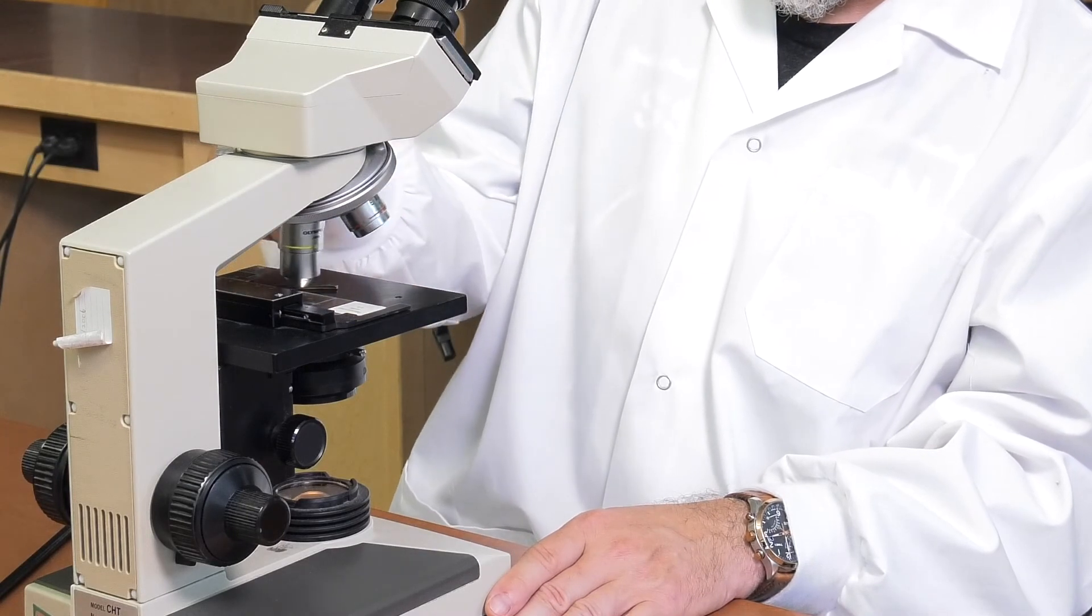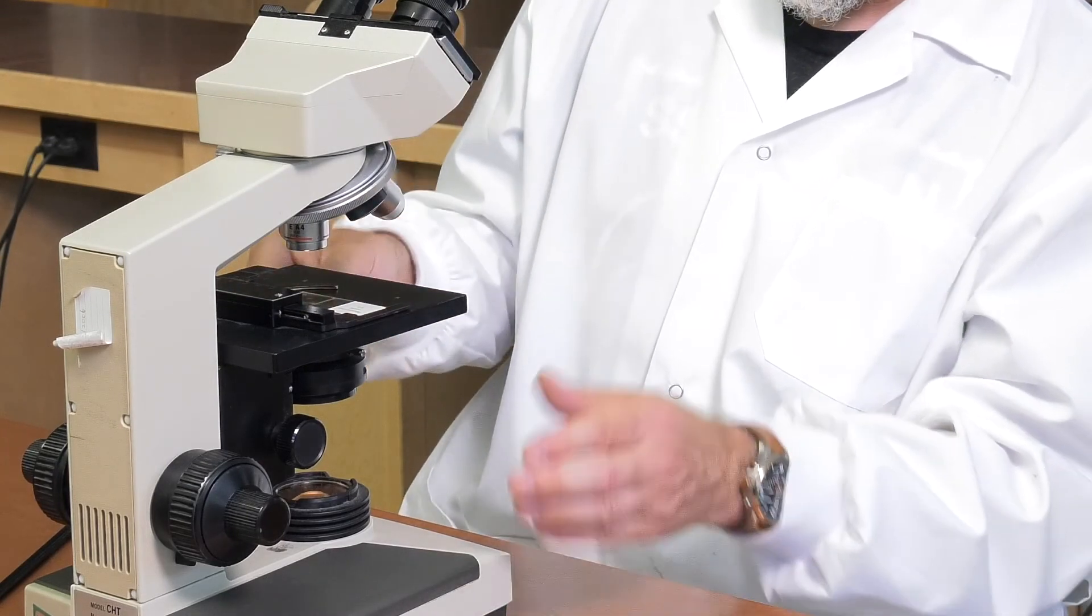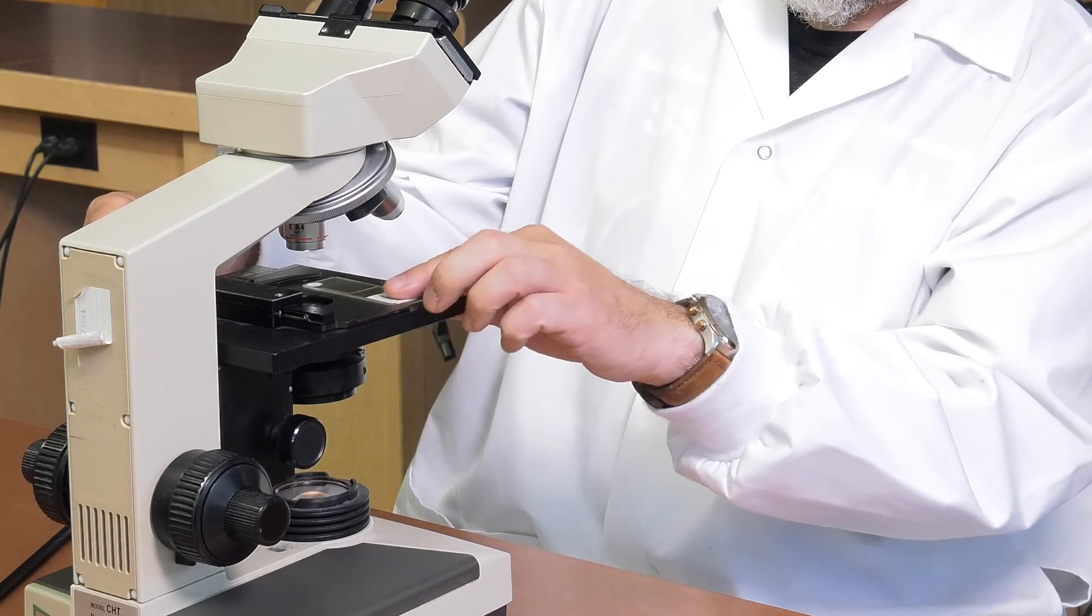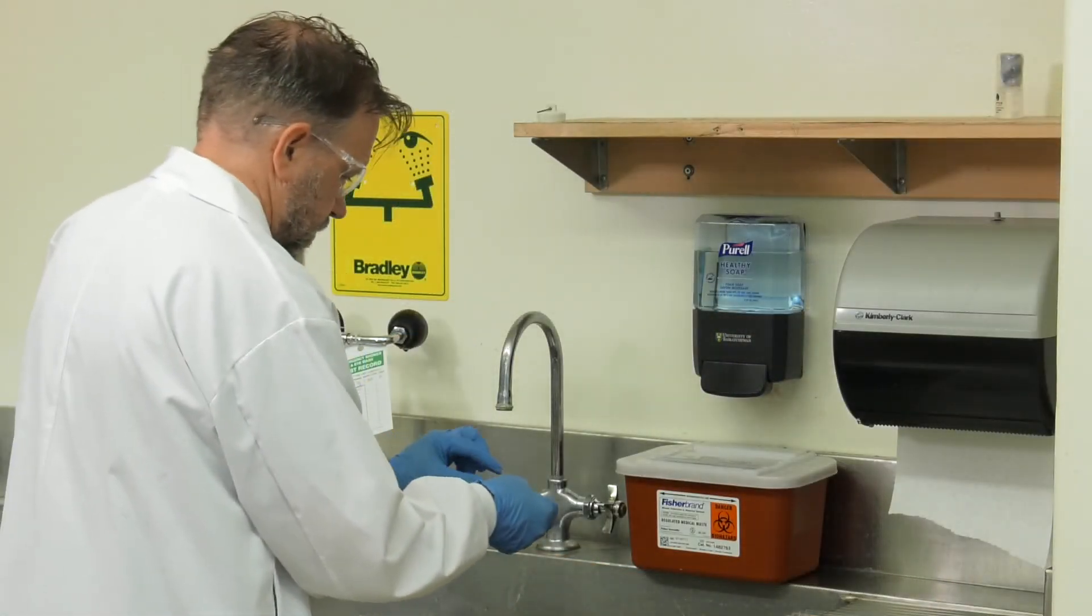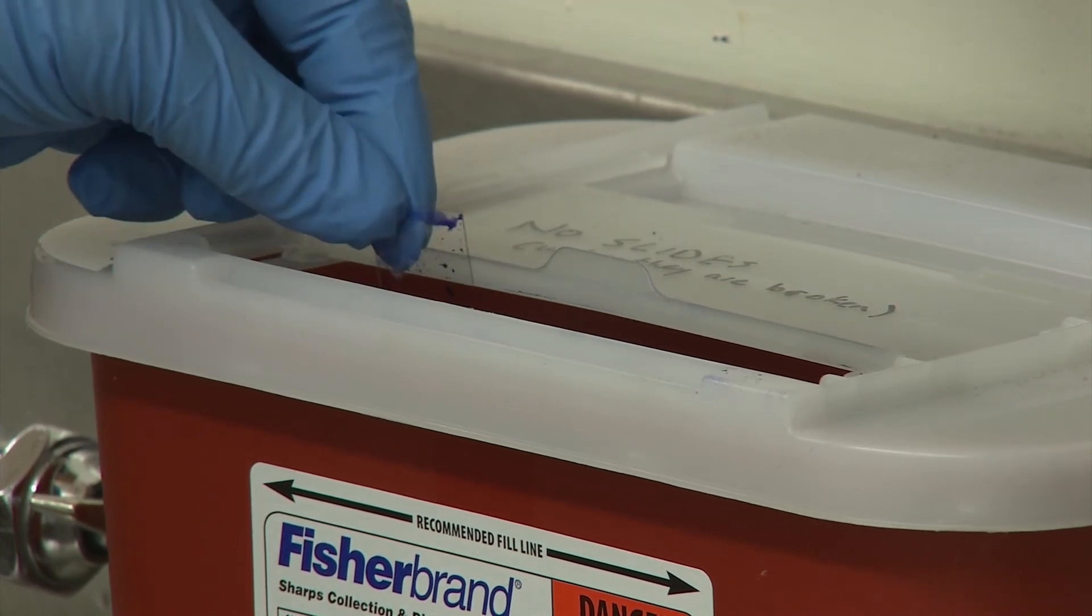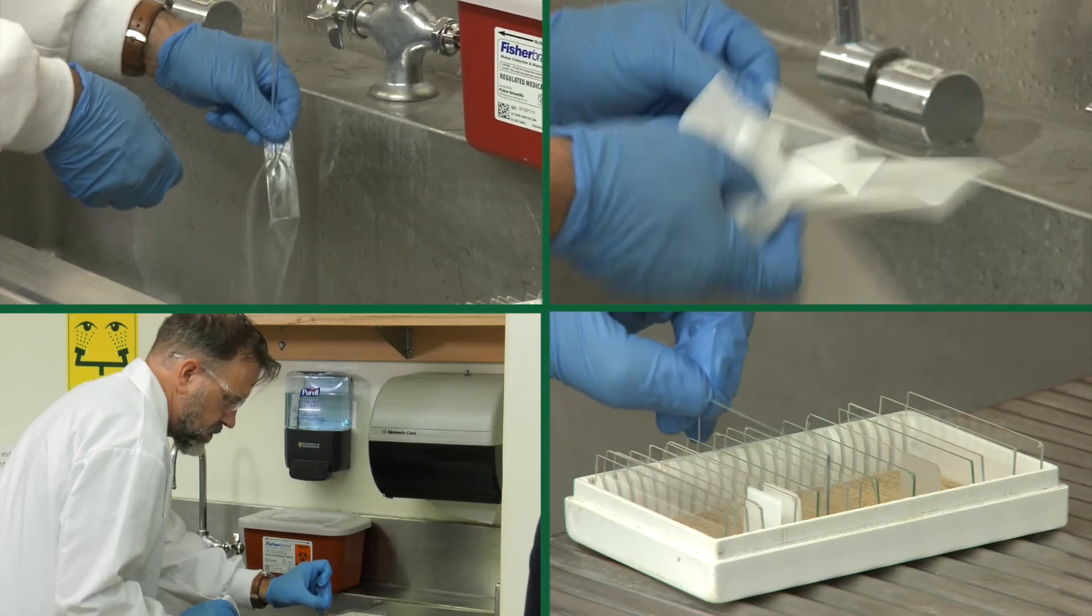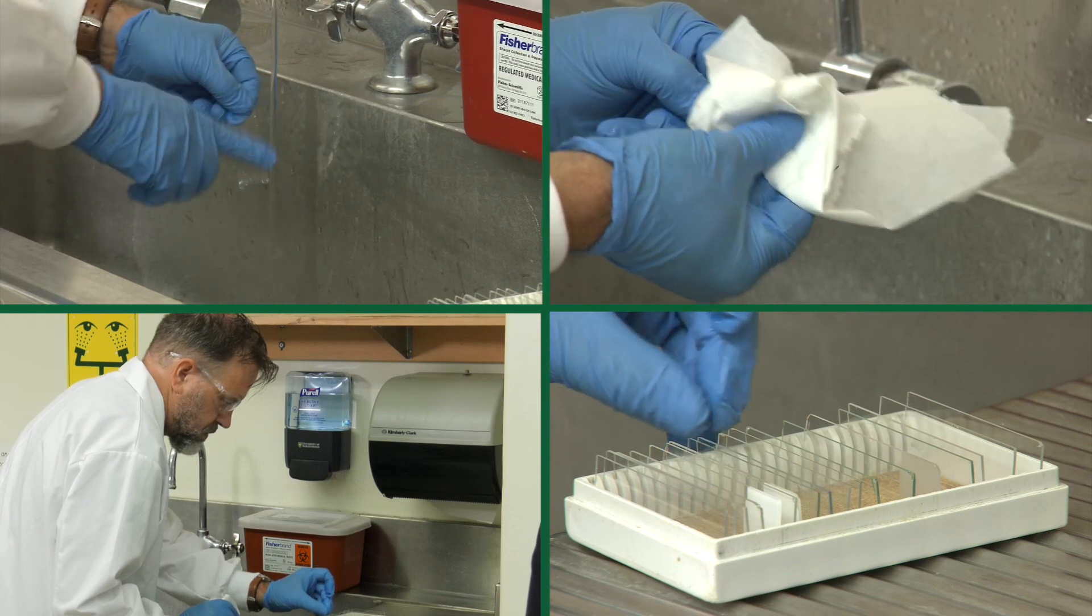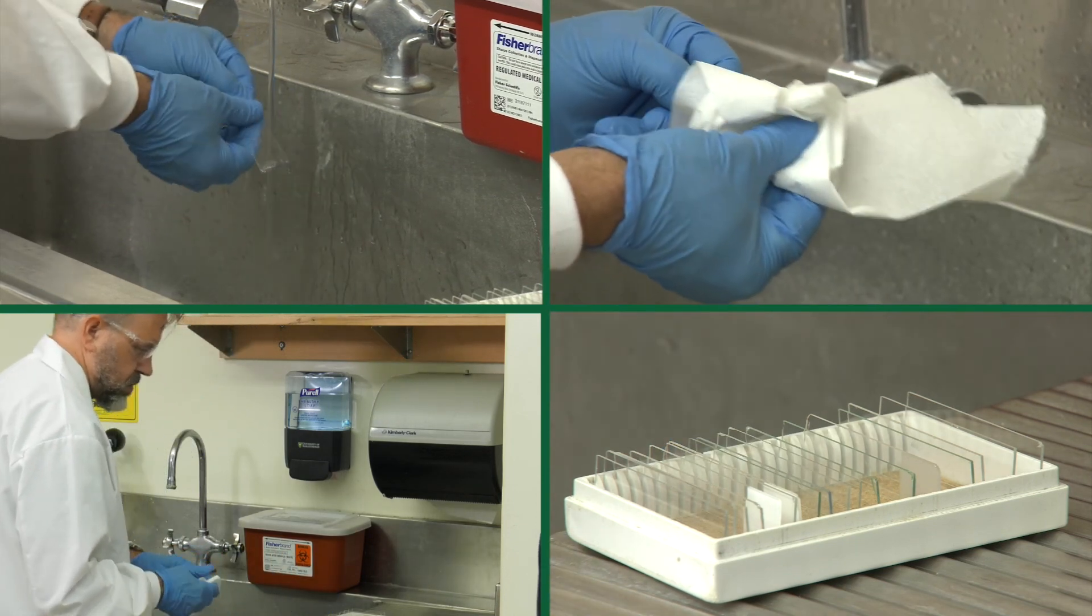Once finished with your slide, rotate to the four power objective and pick up your slide. The cover slip can be tossed into the sharps disposal bin at the sink. Don't try to clean them or they will break. The slide itself should be rinsed, washed with soap, rinsed again, and dried with a paper towel before being returned to the slide box.